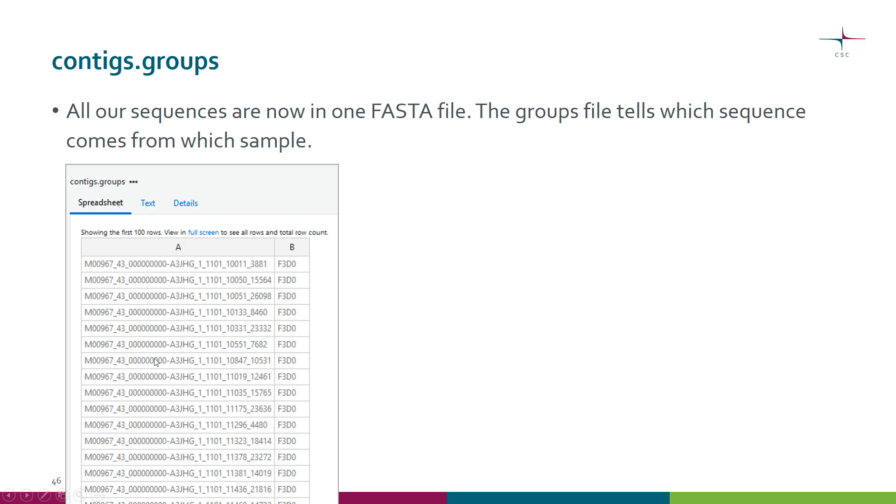Here we have a sequence name and then the sample that it comes from.